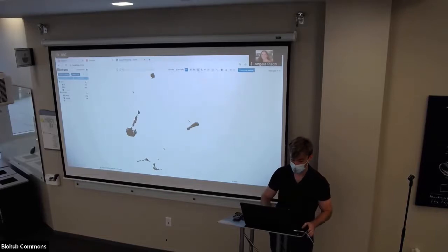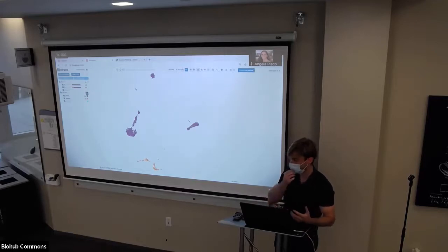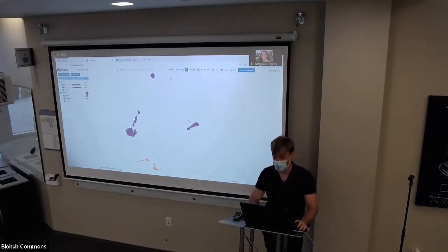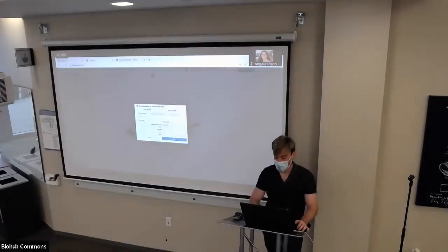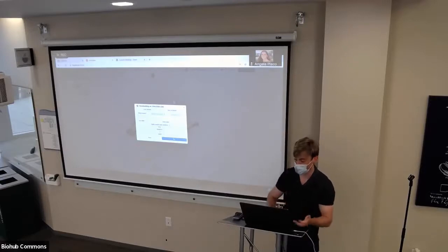And now we're ready to run our data. I told you guys that we're going to correct for this batch effect. This is actually one of the initial motivations for interactive analysis, because I think Merlin and the zebrafish people were really trying to do this subclustering of their data, which I'll show you in a moment. And when they're doing the subclustering, it's actually removing the batch correction in the process. So they're getting batch effects in their view in their subclustering. That actually led me down this rabbit hole of unlocking all these different options that you would typically have in the Jupyter notebook, but now from the front end.